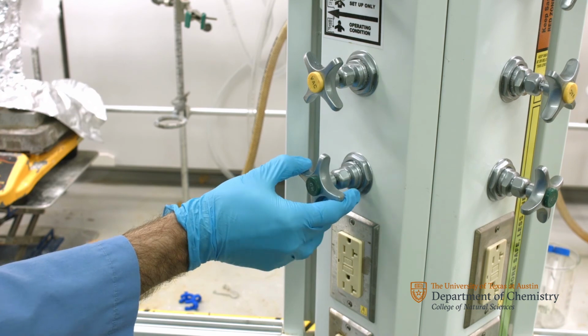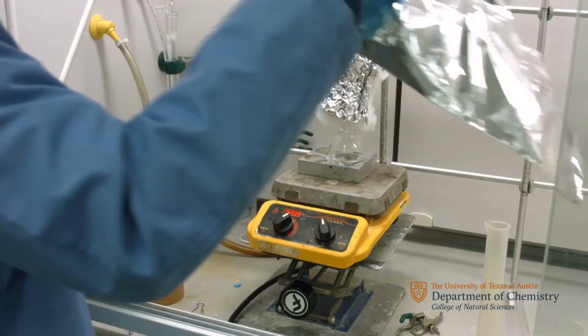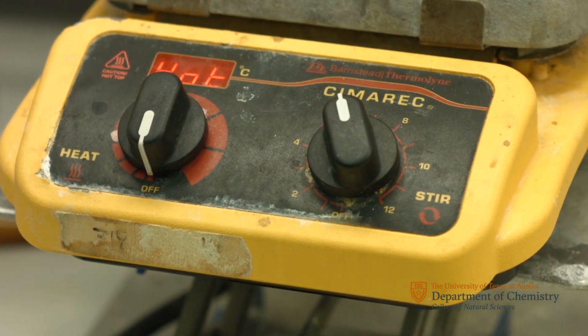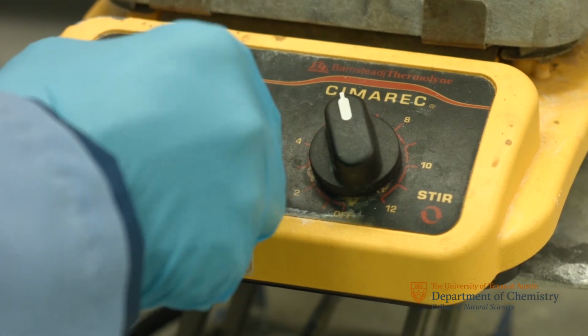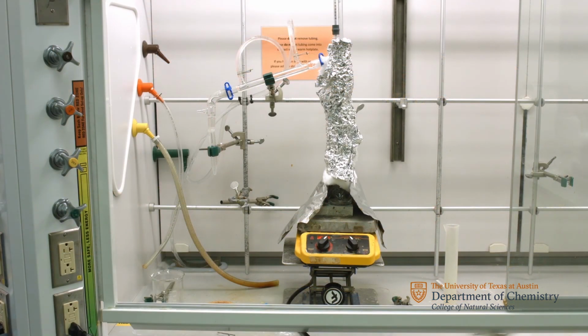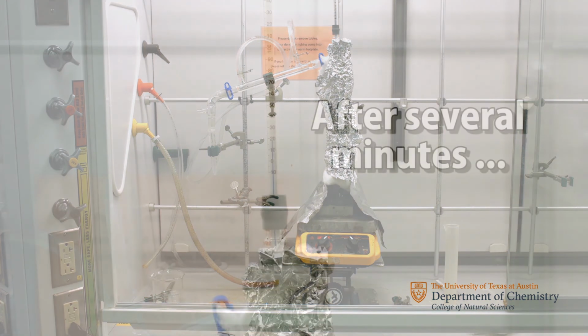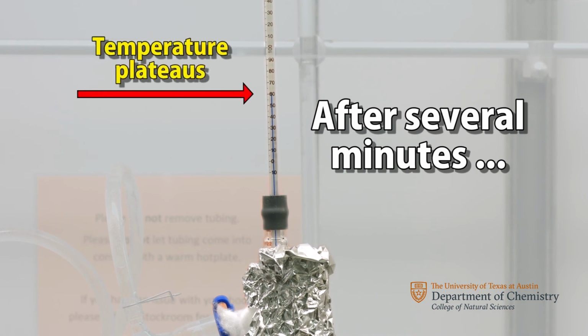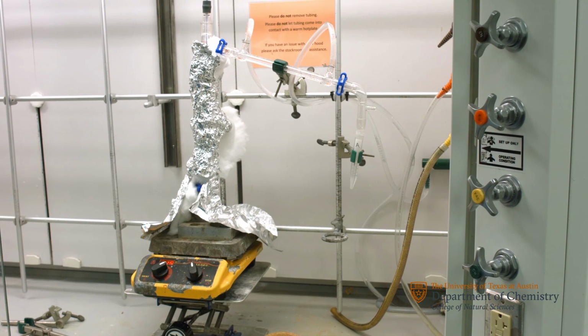Slowly turn on the water so that it flows, filling up the condenser. Wrap some aluminum foil around the distillation flask and the hot plate. Turn on the stir plate so that the stir bar is spinning gently. Turn on the hot plate to the setting as directed by your TA. After several minutes, you will notice the temperature start to rise, and at some point, it will plateau. Collect distillate in centrifuge tube A until the temperature starts to rise a second time.